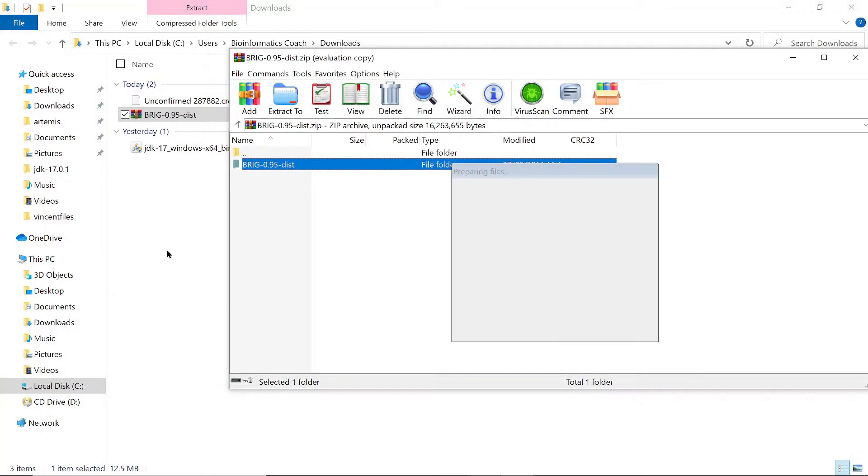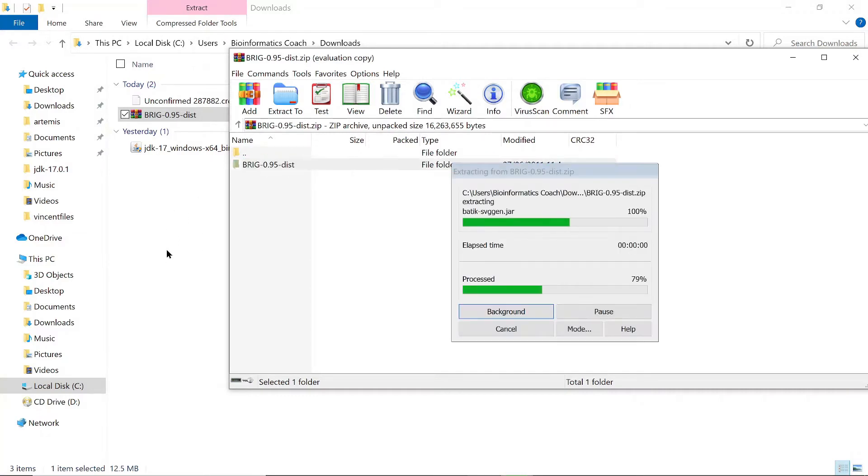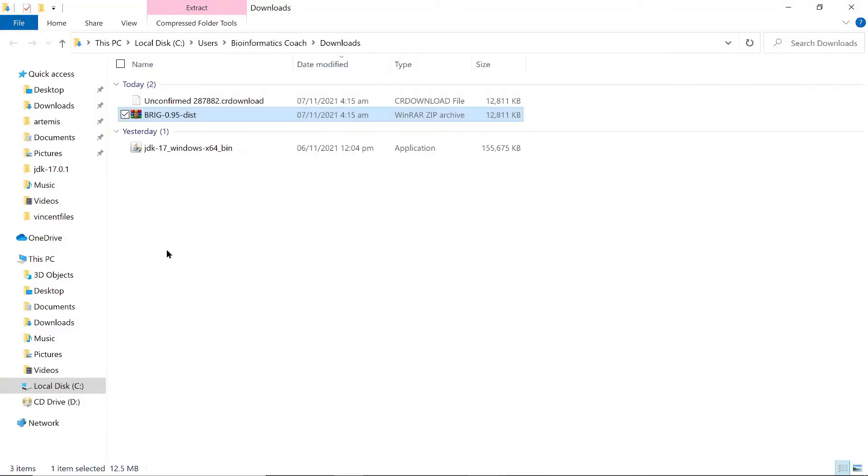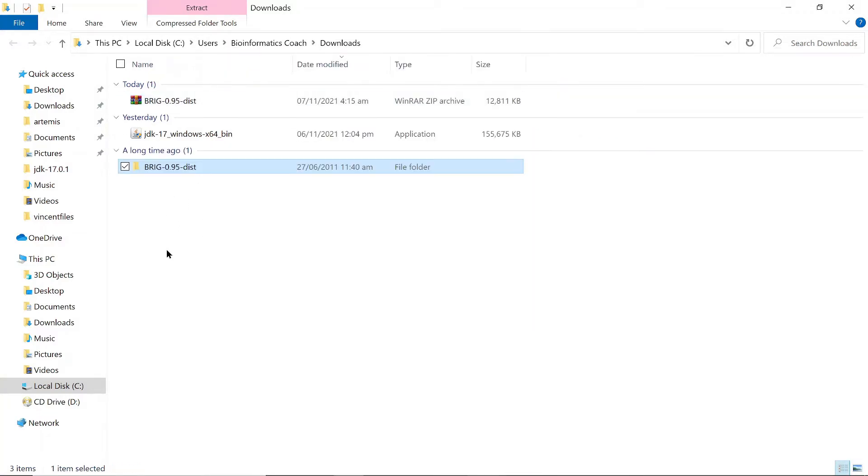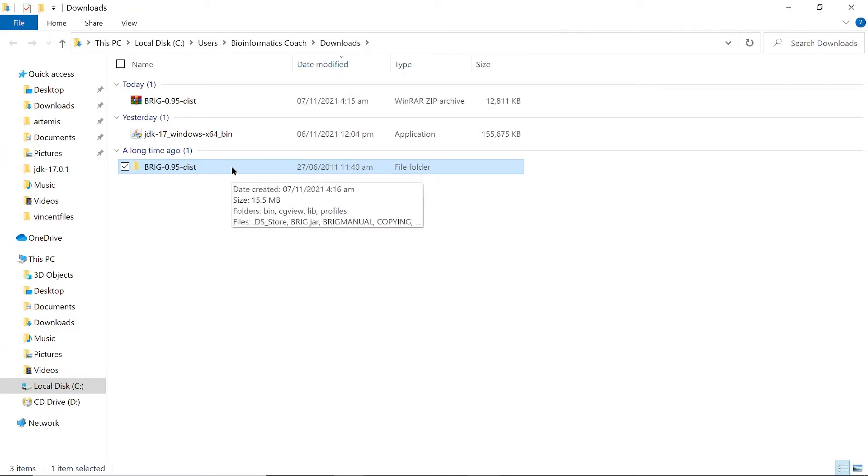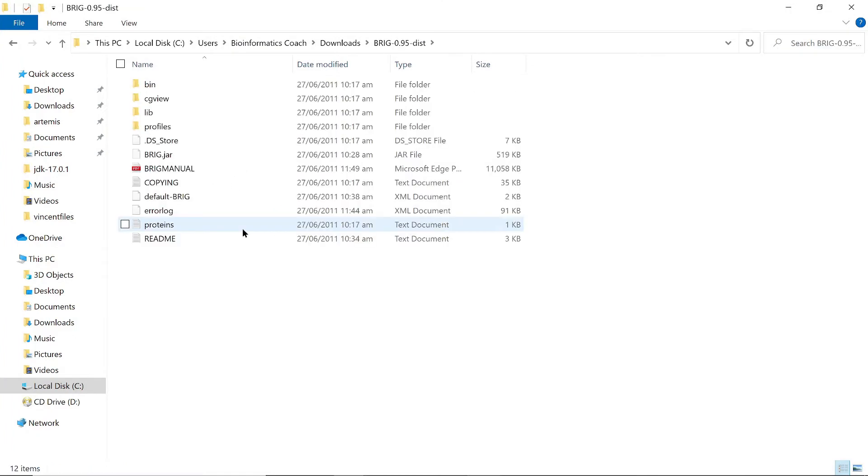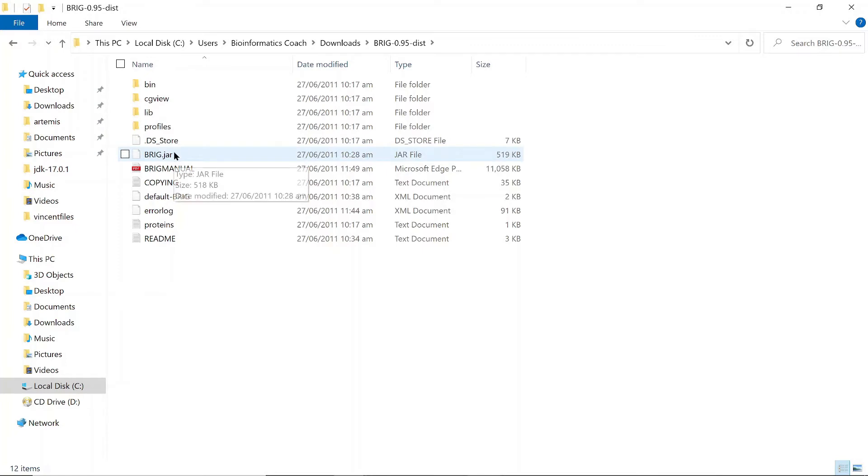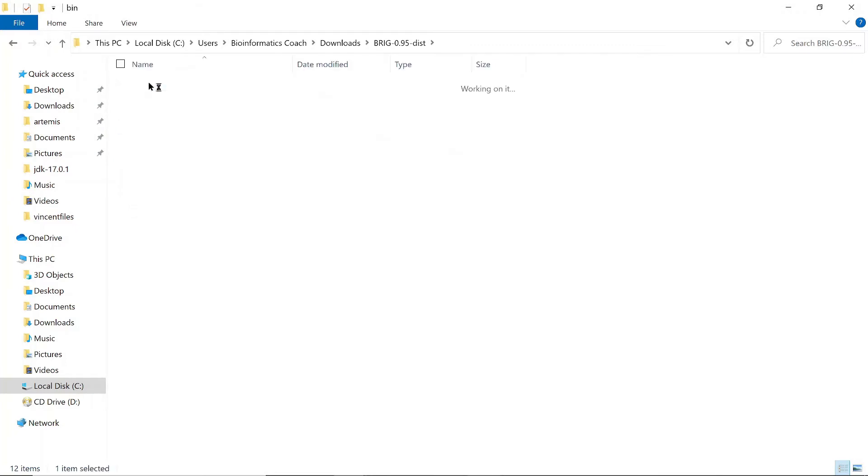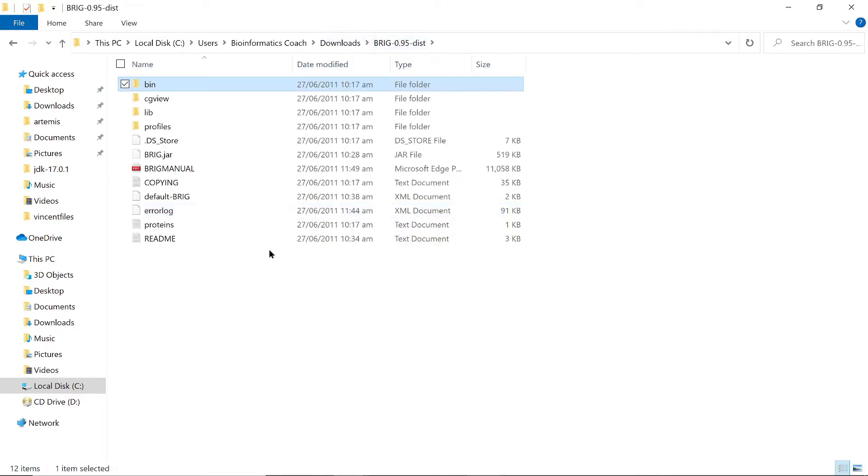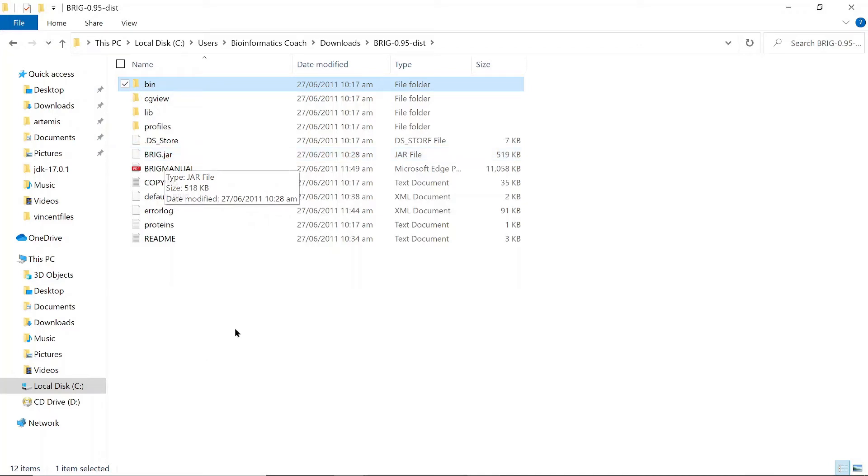So let's just open it and then look at the contents. These are the contents. This BRIG.jar—let's go to bin and there's nothing there. Yeah, so it's fine. This is the file we use, the BRIG.jar. It's a Java file, so this is what we use Java to open.